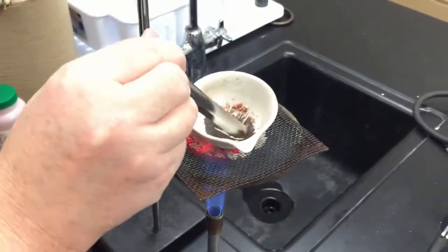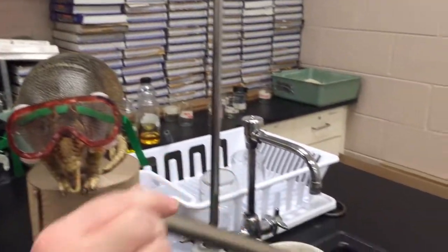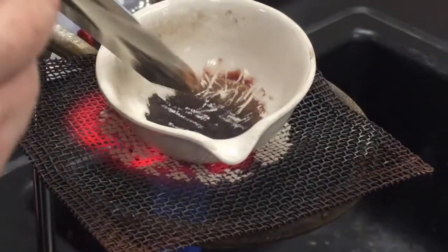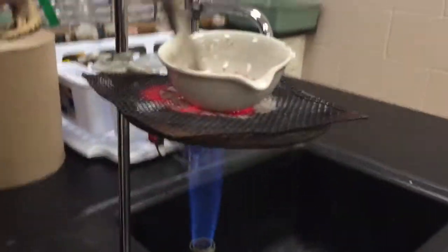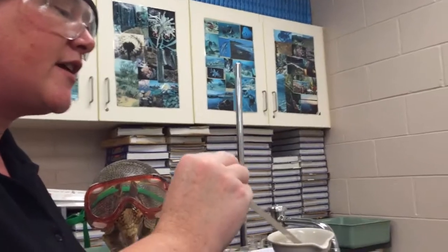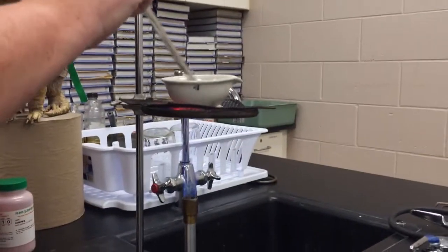The question is, is a new substance being formed, or is the copper changing color simply because it's a different temperature? Color changes can indicate a chemical reaction, but they don't always have to. There are some substances that will change color with temperature changes.